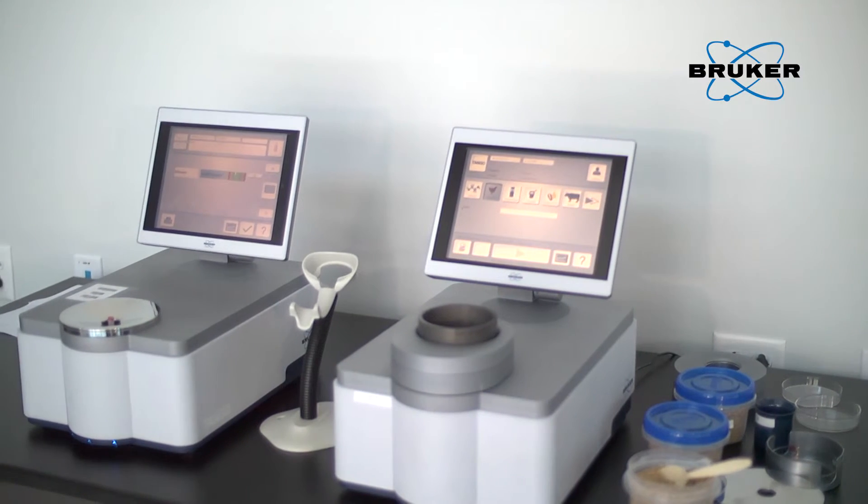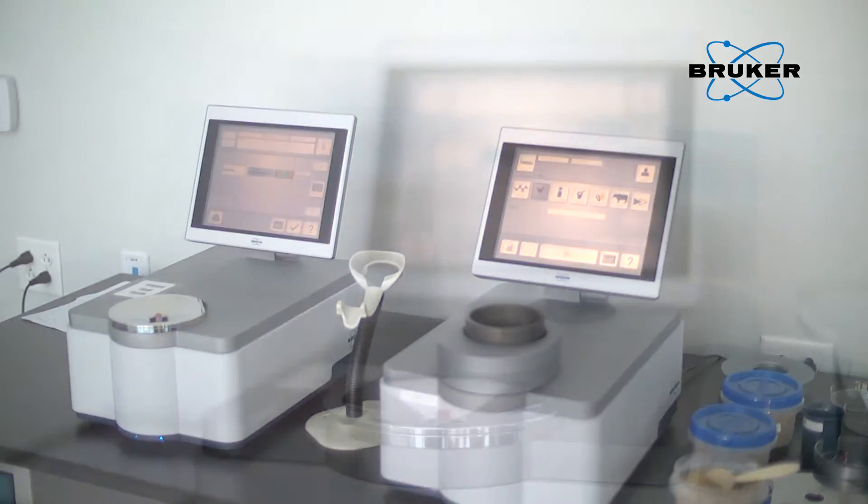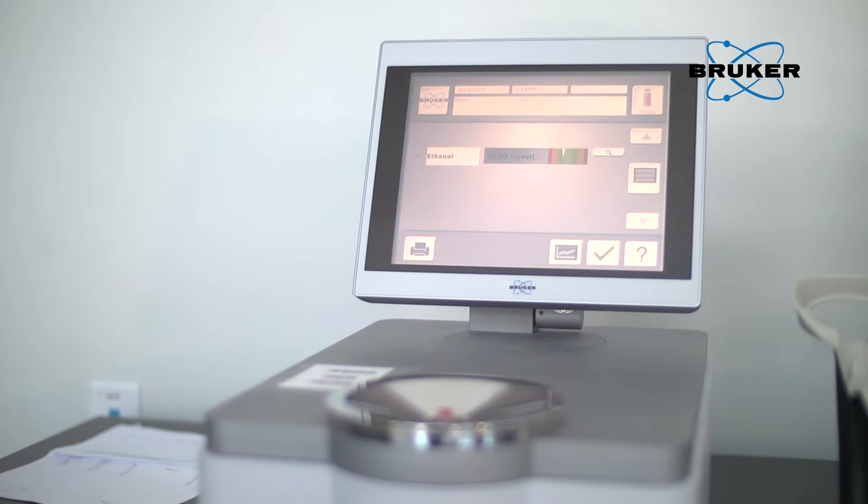There are two types of Tangos. There's the Tango T for transmission measurements, and the Tango R for measurements in reflection.